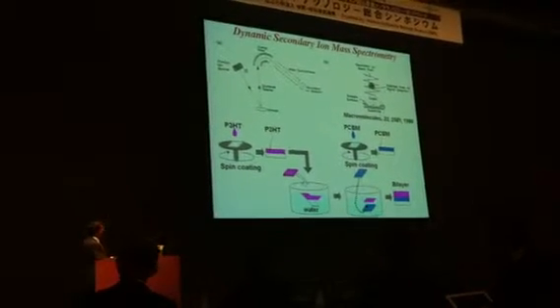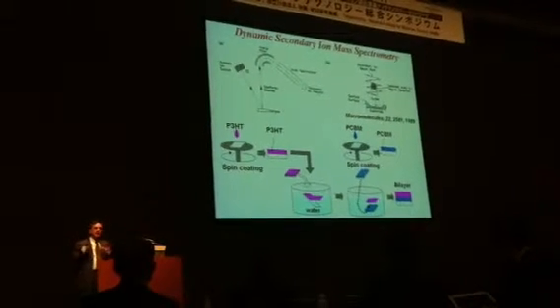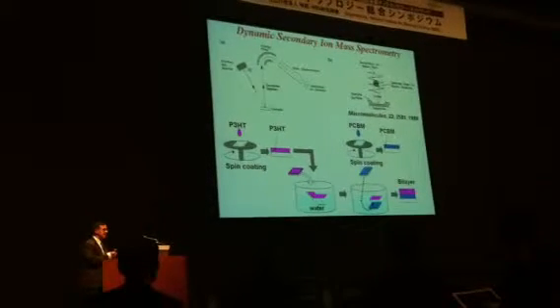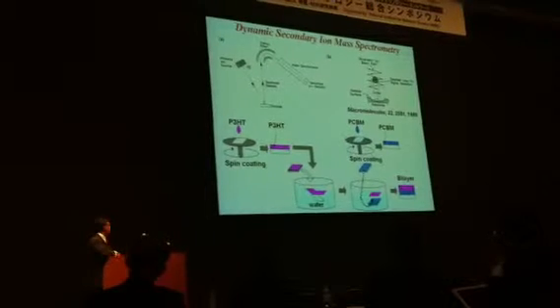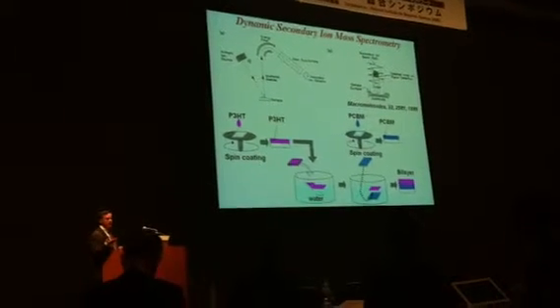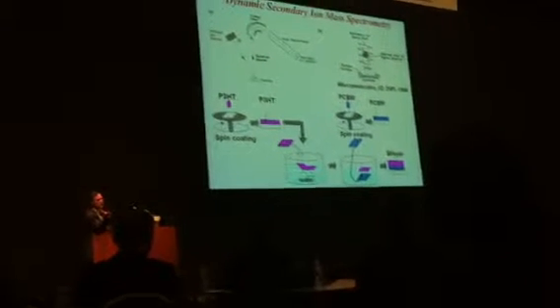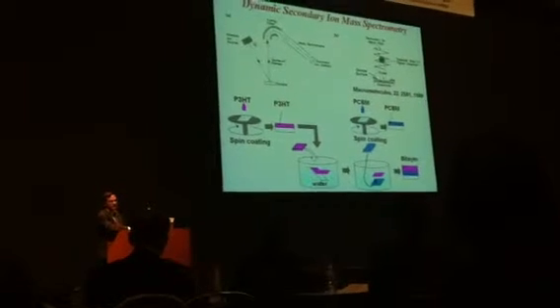And what we've done is that we spin-coated, we wanted to look now at not just the mixture of the materials, but also how the P3HT and PCBM are interdiffusing, because that's important. We're heating the material to 150 degrees centigrade. So we take the P3HT, spin-coat it on a silicon wafer. We can take this now and transfer it to the surface of water, allow it to float on water. We take a separate substrate, spin-coat a film of PCBM, and then we can take the P3HT and place it on top of this, all right?